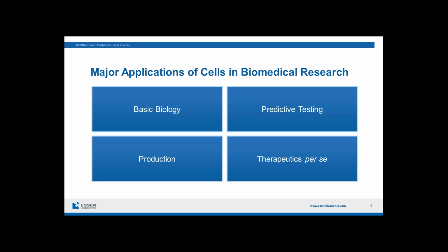On this next slide, I've tried to capture some of the major applications of cells in biomedical research within the context of these fundamental challenges. So in the top left-hand corner, basic mechanisms of biology, understanding signaling pathways in cells, understanding how cells join together to form tissues, understanding how tissues form together to form organs and whole beings.